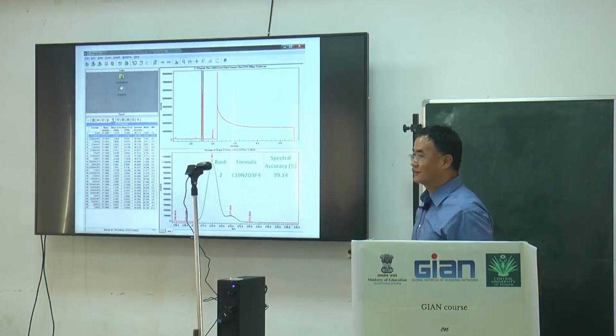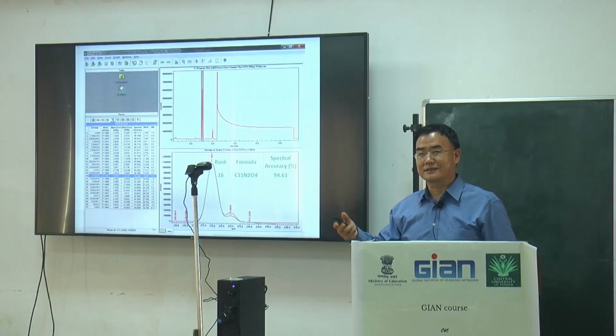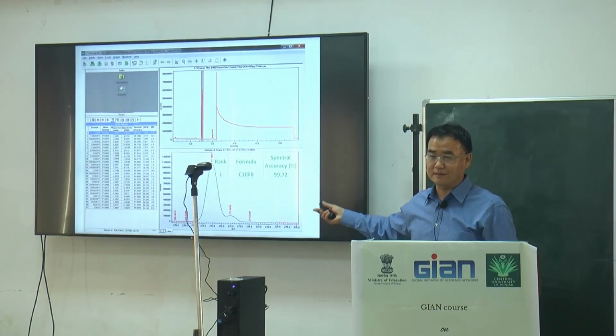For MS, usually when you first buy a machine, you consider the cheaper one that can do many goals.